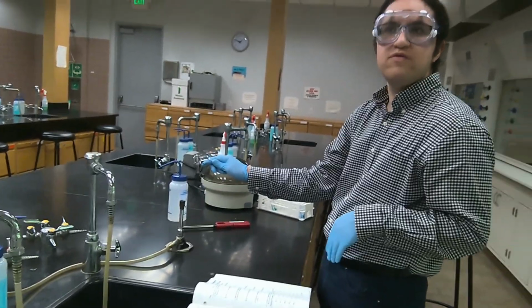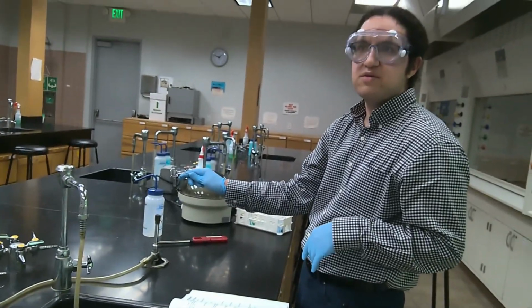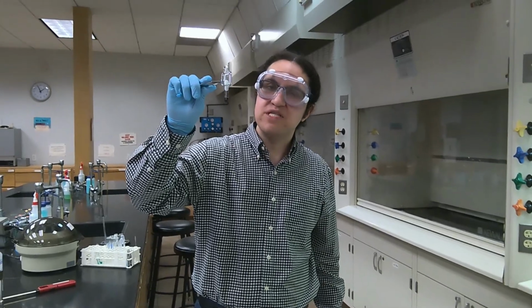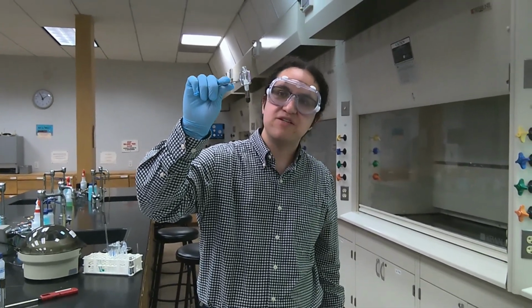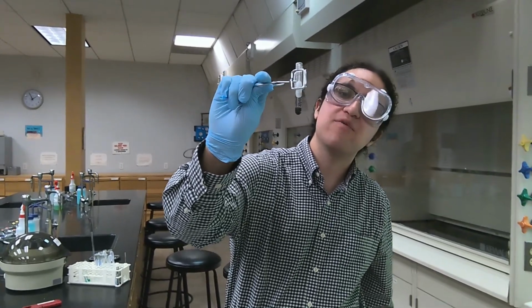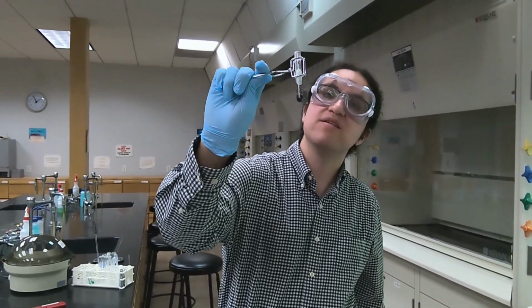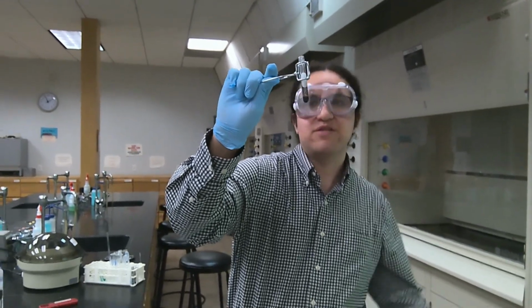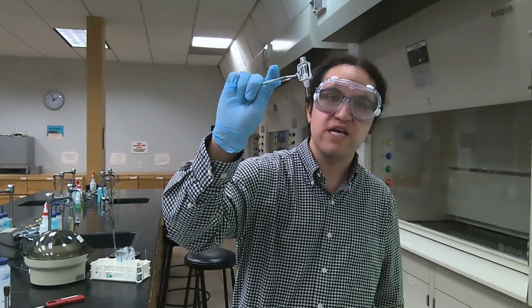And we'll resume once we've dried both of our copper samples. So after heating, I've added some deionized water just to make it a little bit easier to see. Notice the distinct color of the copper oxide solid. Notice how it's distinct in terms of a marquee physical property such as color from our copper hydroxide.